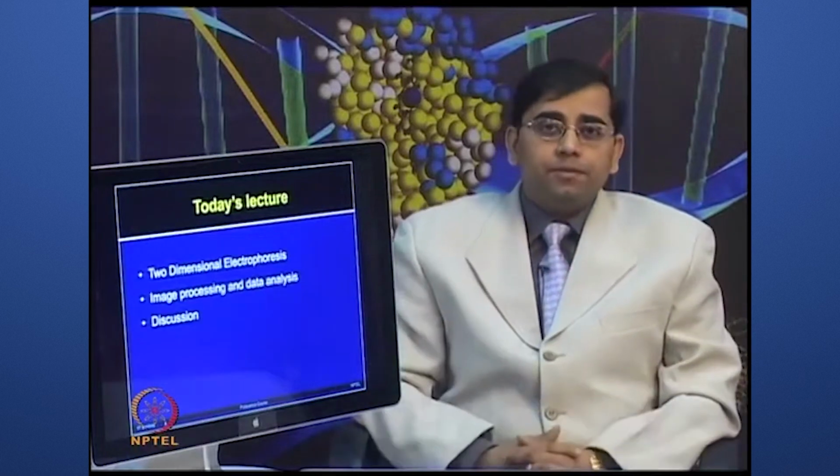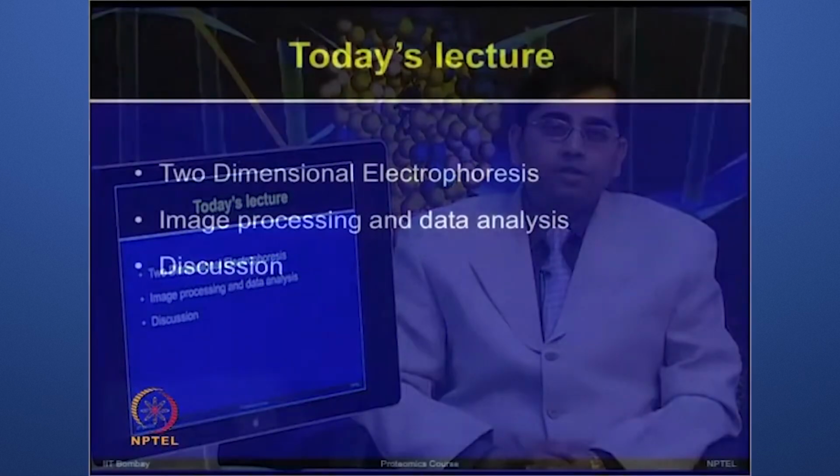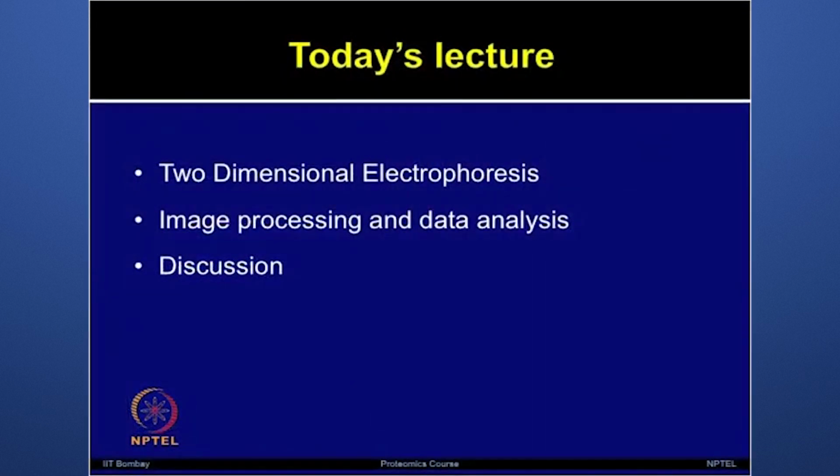So, in today's lecture, continuing our focus and theme on two-dimensional electrophoresis, we will discuss image processing and data analysis, various challenges associated with image processing, and what steps are required to perform data analysis.